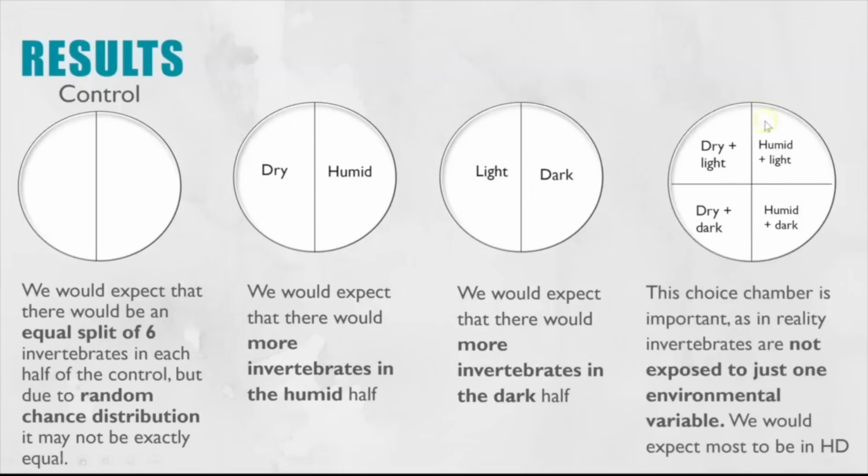And the final one, this is a really important choice chamber because in reality, invertebrates are not just exposed to one environmental variable. It's more likely to be a combination of the different variables. So we would expect this time most to be in the humid and dark chamber.